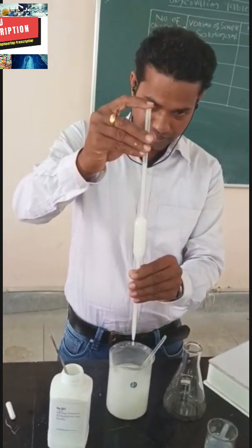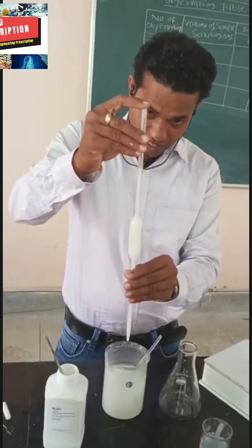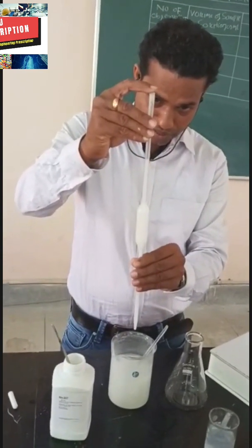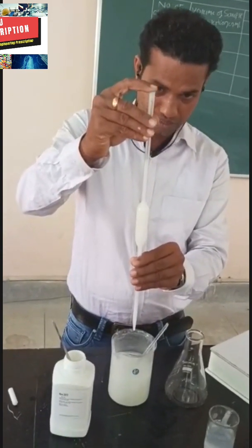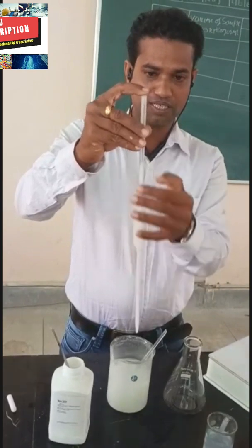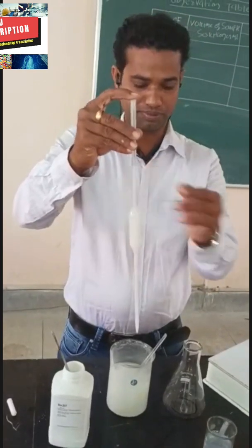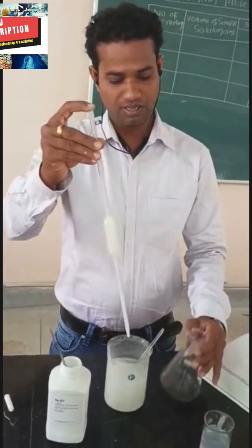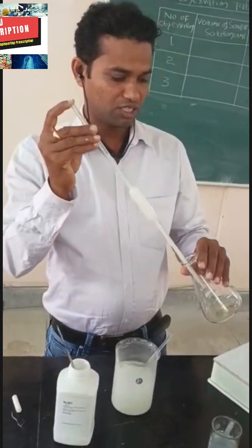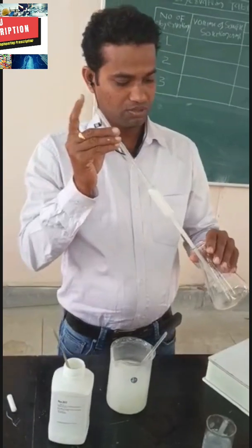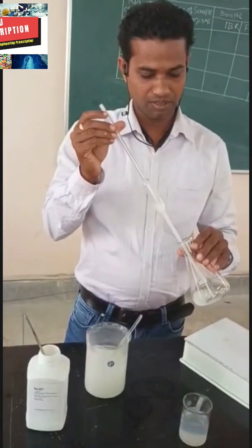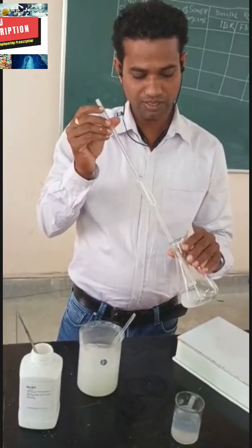We pipette out the sample up to the mark, which is 25 ml — yes, up to this mark is 25 ml. Now transfer to the conical flask.